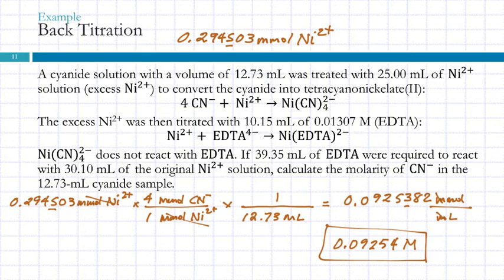But more importantly, if you want to work in an analytical lab, somebody else needs to be able to see what you did, right? And so that's where writing things out with the chemical formulas and the labels with the units and everything matters. Now, a calculation like this, if you were doing a lot of different samples, might need to be done over and over again, right?